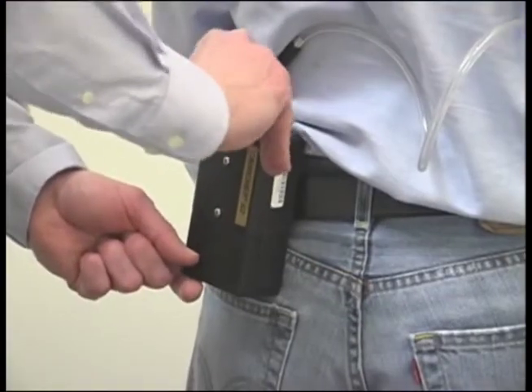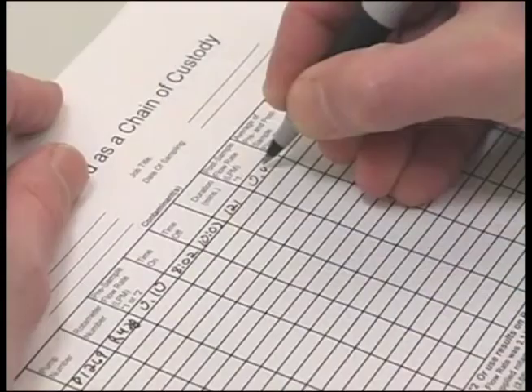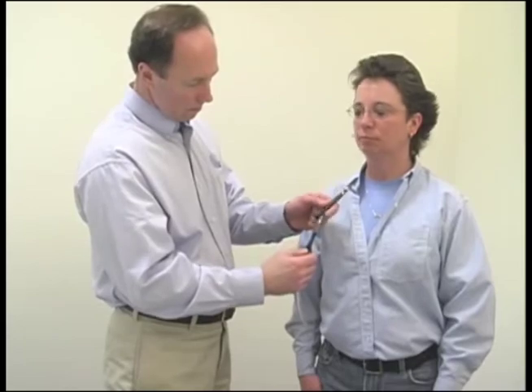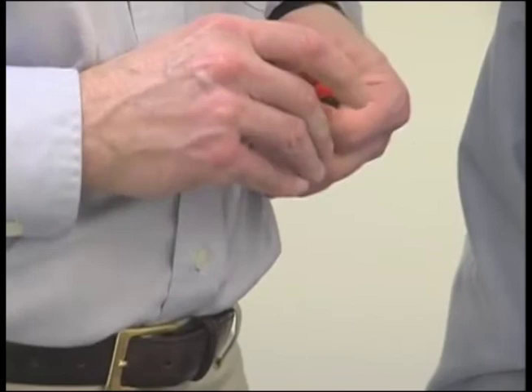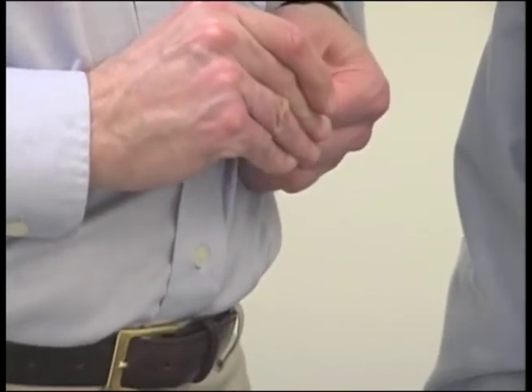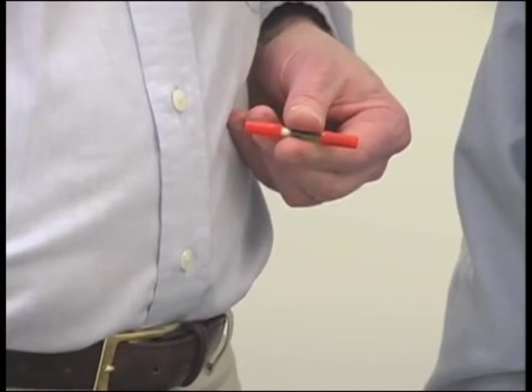After sampling is complete, turn off the pump, record the time, seal the sorbent tube with the red caps provided, and remove the sampling equipment.